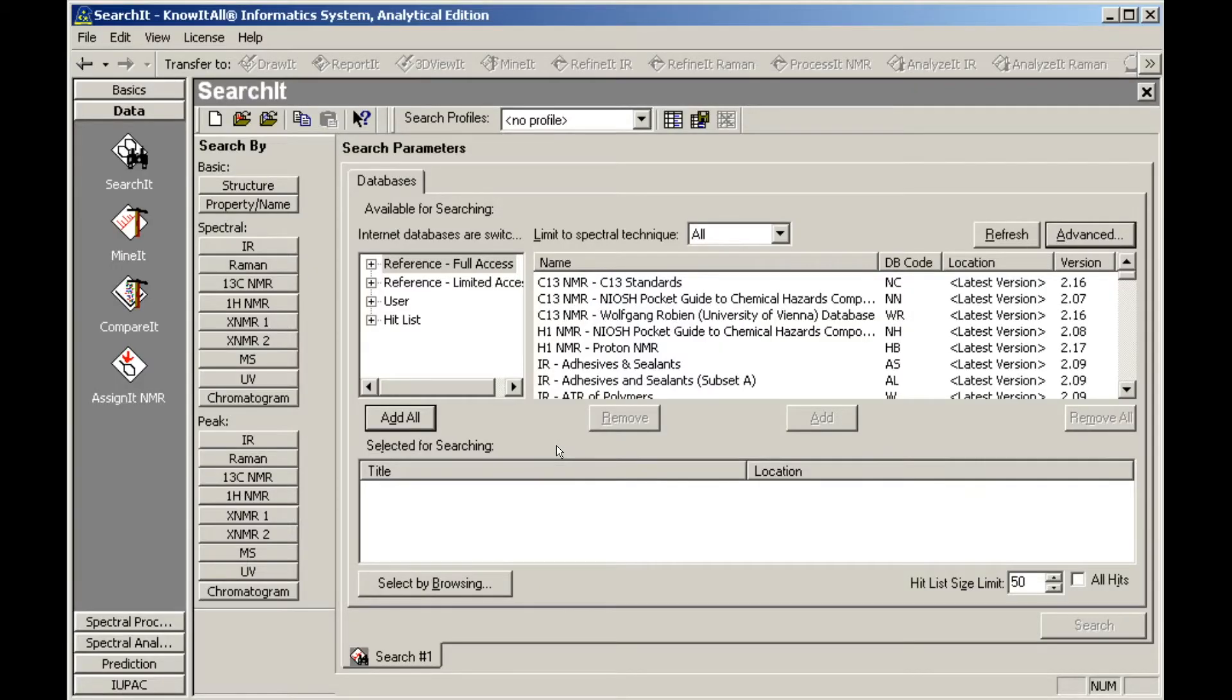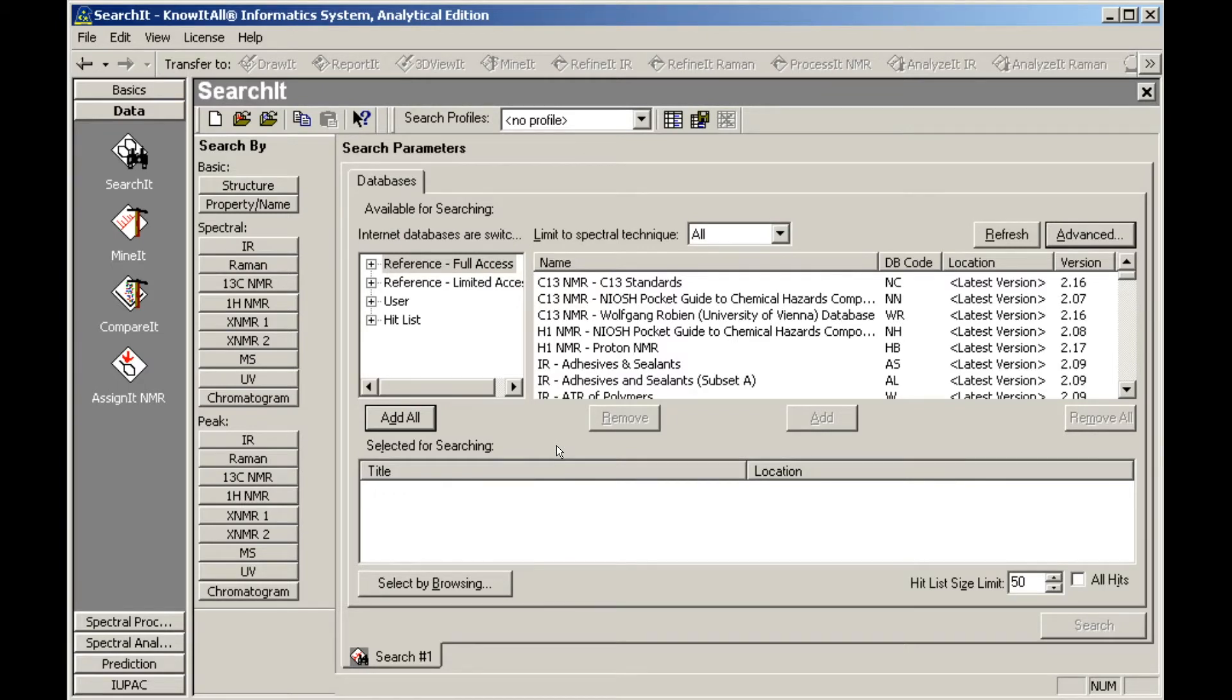The Search-It application can be used to perform spectral, peak, property name, and structure searches, either individually or in combinations.